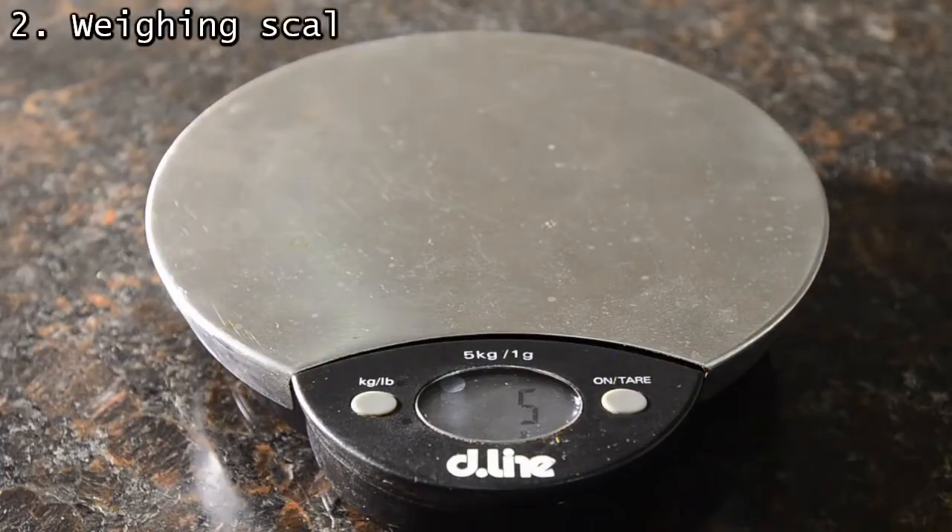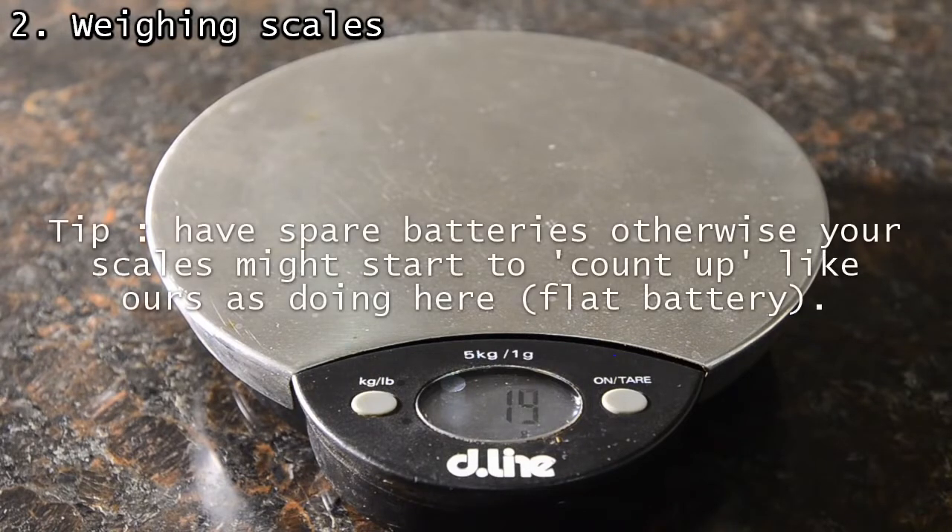Without measurement there is no science. We have accurate scales, but you would be surprised how often we simply use a good pair of kitchen scales like these for weighing. These are accurate to the nearest gram only, but most of the time you can get away with slight excesses of reagents without a perfect stoichiometric ratio.